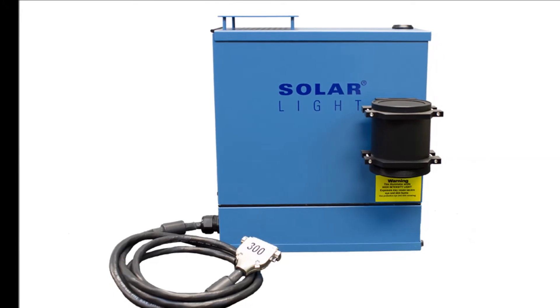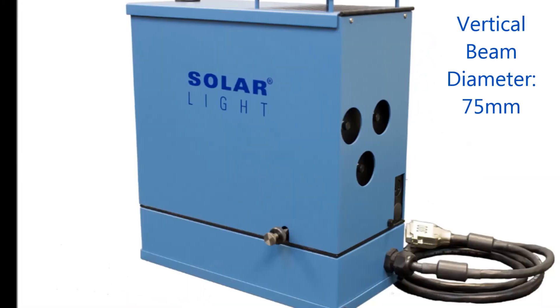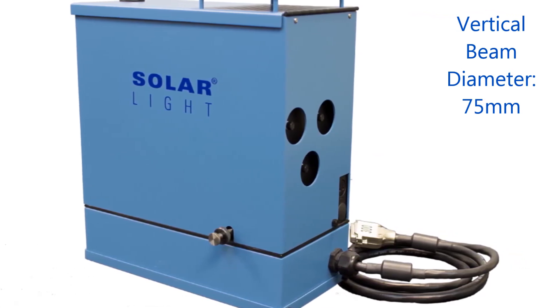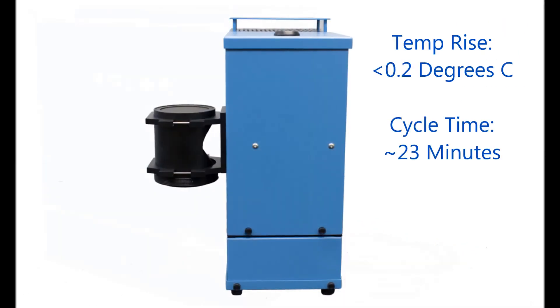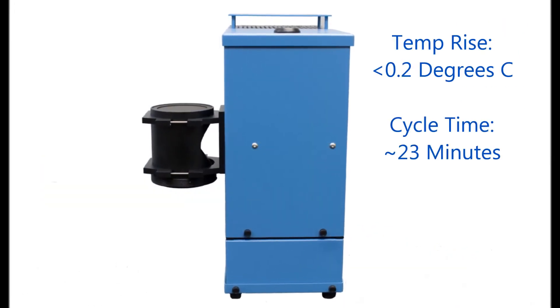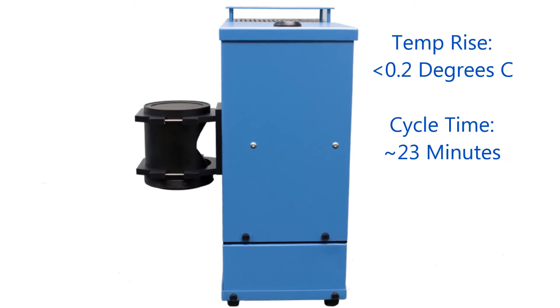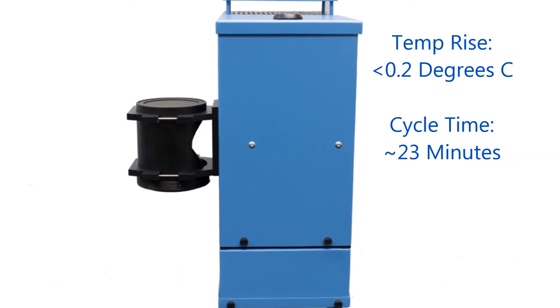The unit's emission spectrum follows the latest ISO and FDA guidelines. The light source has a 75 mm diameter vertical beam, which is large enough to completely irradiate a 2-inch square molded or sandblasted PMMA plate. Temperature rise of the plate is less than 0.2 degrees Celsius during the entire irradiation, and the cycle time for irradiating a plate with 4 MEDs effective dose is only 23 minutes.